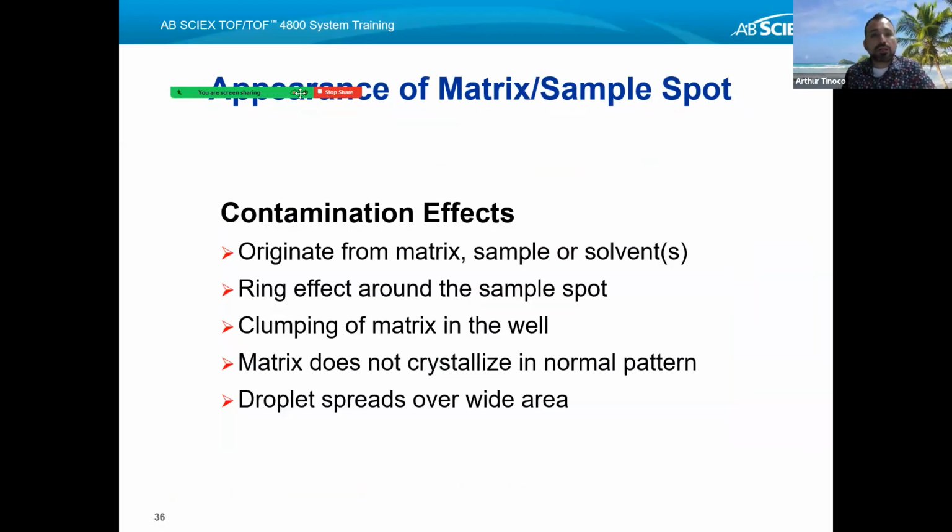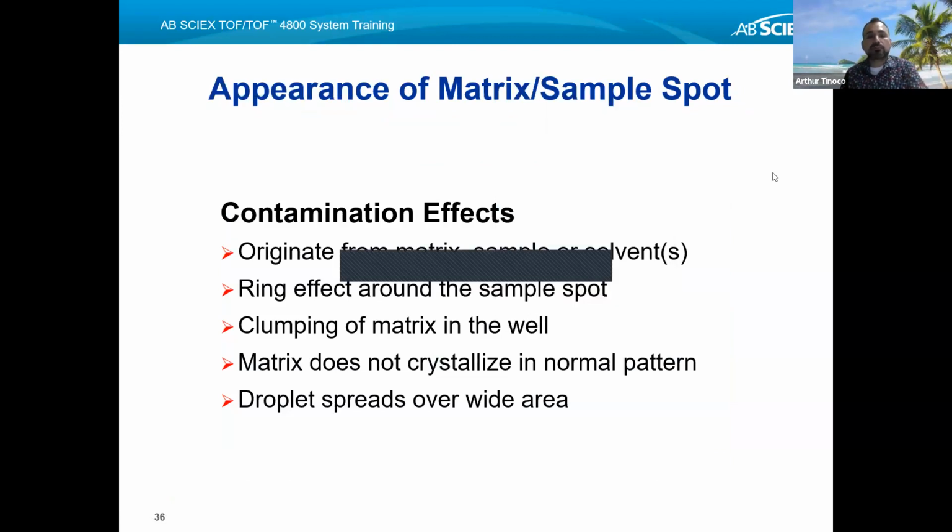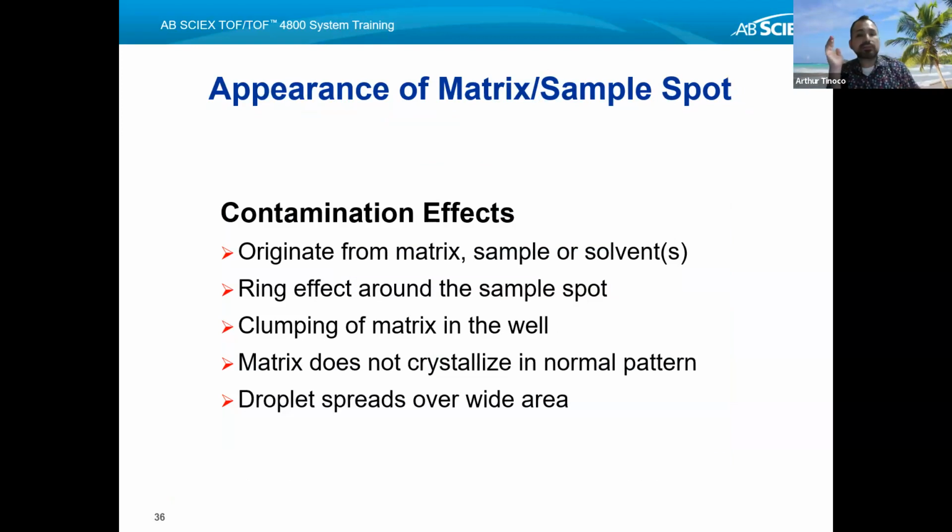All right, so when it comes to preparing the next set of solutions, it's very important to be aware of the type of things that can cause contamination or low quality sample prep. There are a number of things to look out for. You may have some contamination that's coming from the matrix itself.